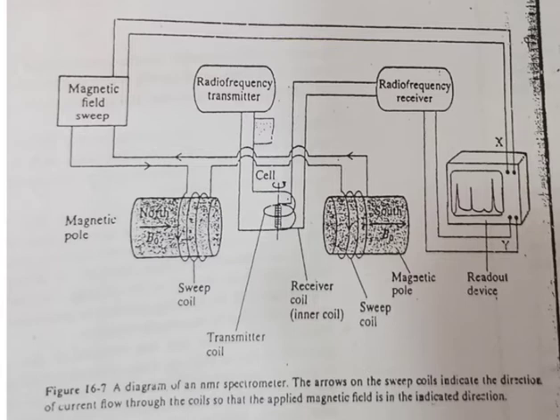Means there are two types of fields. The first one is a magnetic field and the second one is radio frequency light, that is an electric field. Means electric field and magnetic field, both types of fields are there. You have to keep at least one field constant. Keep the magnetic field constant, the radio frequency can be measured. When the radio frequency is kept constant, you can measure the magnetic field. So here at the readout device, two ways are there. See, the first way is the X way and the second way is the Y way. So two types of measurement are done.